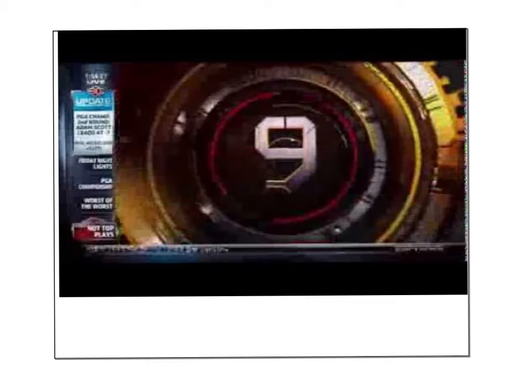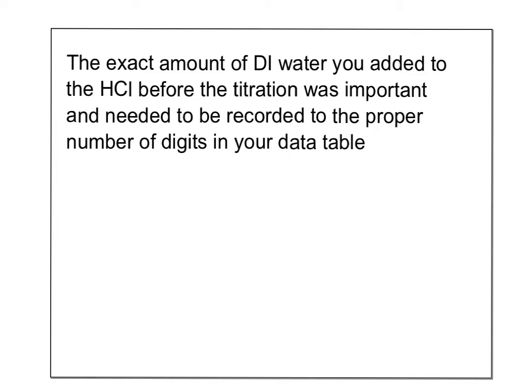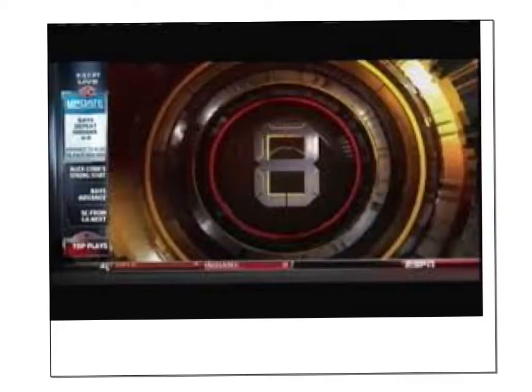Number 9. So you guys got the acid, the HCl, it was 0.05 molar from a burette up front, and then you measured deionized water and added it to the acid before you did the titration. It was important that you knew the exact amount of water added and that you recorded it to the proper number of sig figs in your data table.